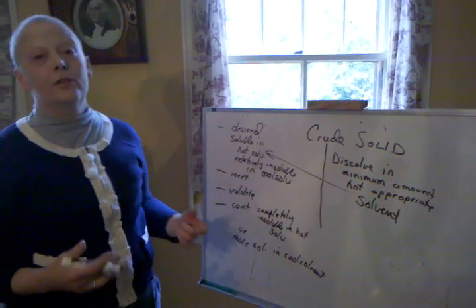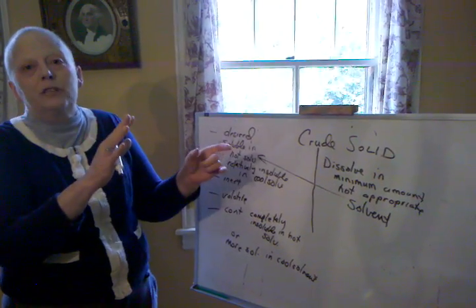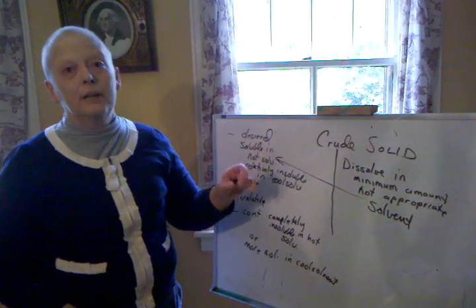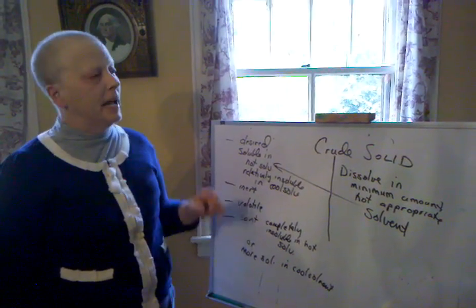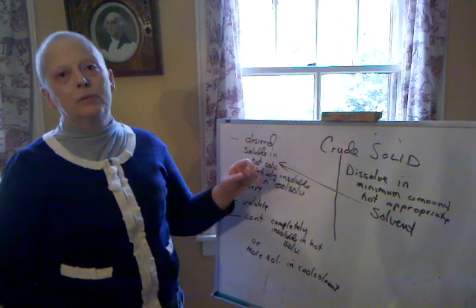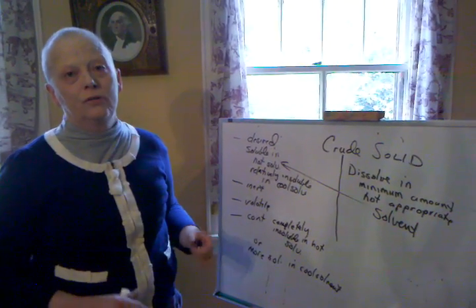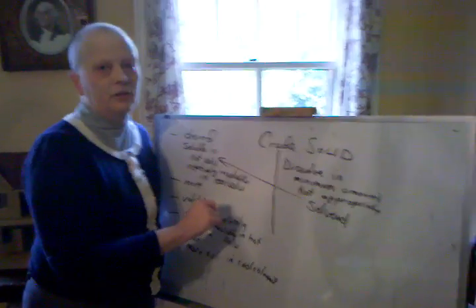That means that whatever you're using, you've kind of picked something that you think has a slightly mismatched dipole moment with your compound, or you've actually experimented by taking a little bit of compound and testing it in a solvent, in a hot solvent. And you've ascertained that the compound goes in when it's hot and some of it comes out when it's cold, or most of it comes out when it's cold. You've experimented. So you've worked this out, and you have a solvent you think is going to work.